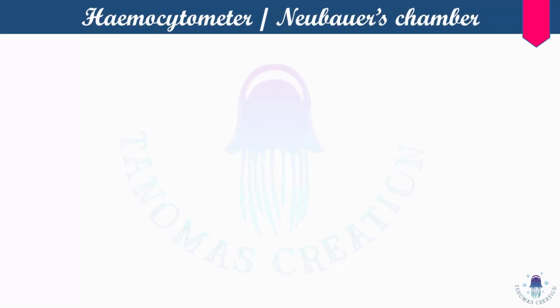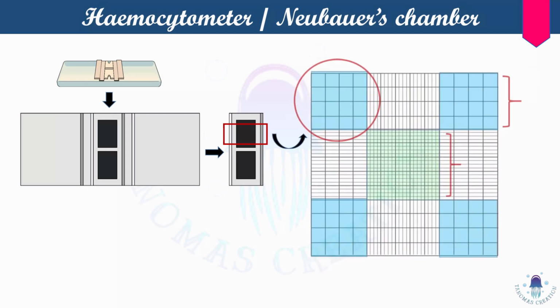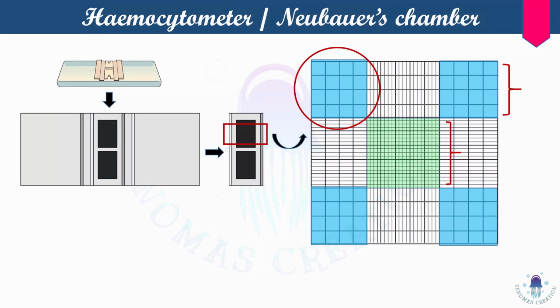Okay. So now, how does this Neubauer chamber look like? If we focus on the Neubauer chamber, we can see there are two places, the same chambers on both sides. You can use any one of them. And if we enlarge one of them, we can see that this chamber looks somewhat like this. Here we can see there are a total of 9 boxes in this chamber. And there are 4 large boxes at the corners of this chamber, colored in blue. And inside each of these 4 large boxes, there are 16 squares.